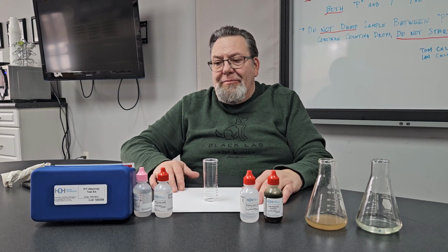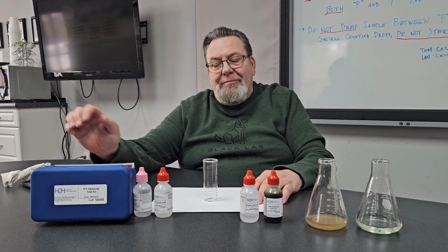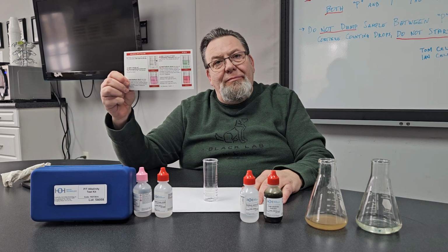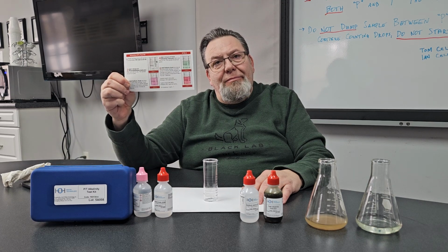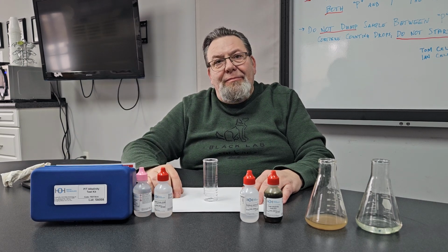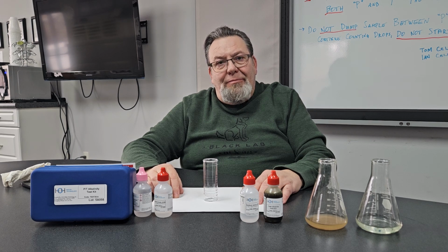First things first, we'll show you what's in the test kit. In the test kit, you'll see your instruction card. This card shows you step by step what to add, what colors you're looking for, and how to do the calculation. Please note that you do not need to do the final calculation for OH alkalinity, as it is automatically done within the cloud reports. Just add the results for the P and T alkalinity.